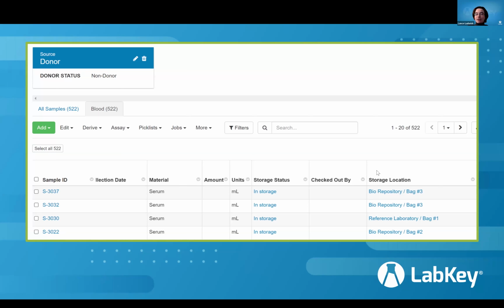But regardless, Sample Manager makes it super easy to pull a list of samples based off of how I organize my data with Sample Finder. And again, this alone would have saved me months of work with my archive project and hopefully saves quite a bit of time for when you're working in Sample Manager.